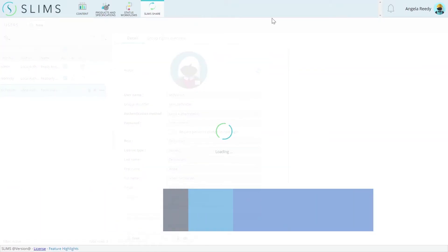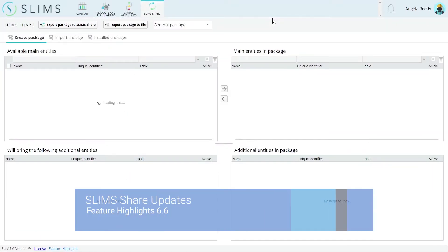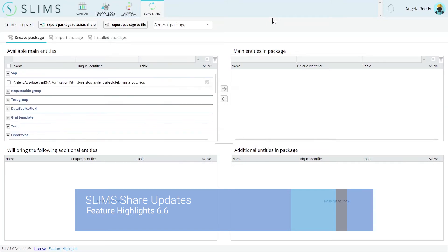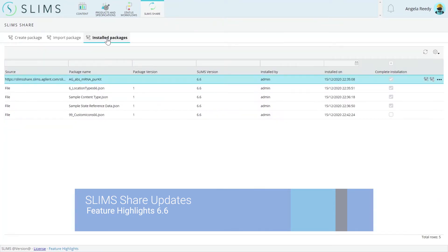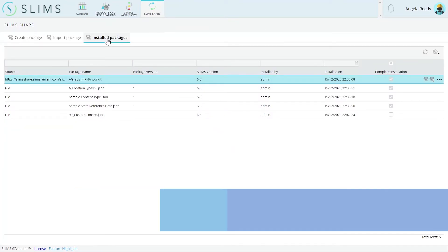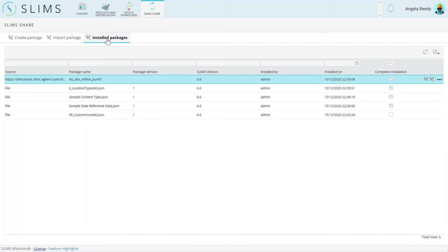The Slims share module has been optimized for ease of use and understanding. Some changes relate to the new Installed Packages tab, which adds a grid that displays all the packages installed on the Slims instance.